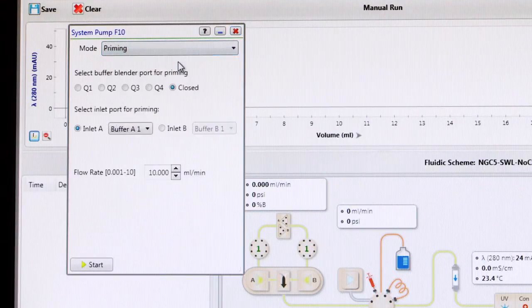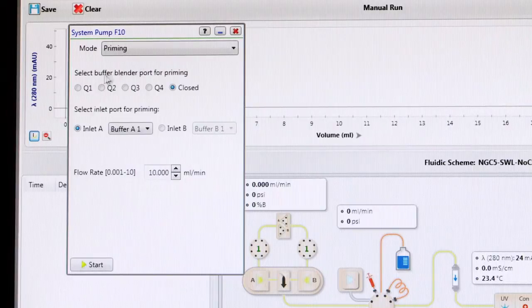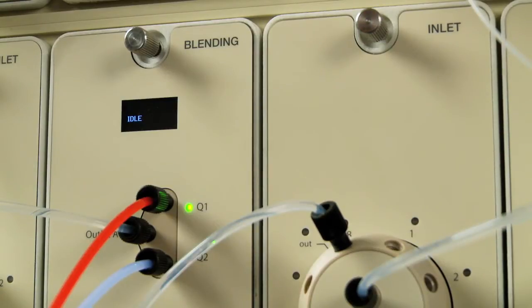Select the priming tab. Select the Q1 port. The Q1 valve opens on the buffer blending valve. In the NGC Discover series with buffer inlet valves, Port 8A will additionally be selected automatically. Note that Q1 will remain open until Closed is selected.